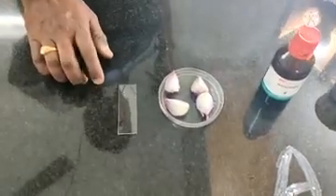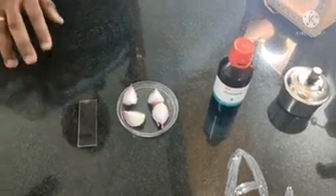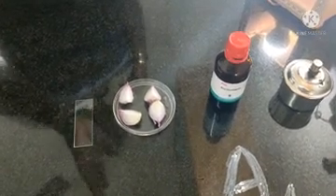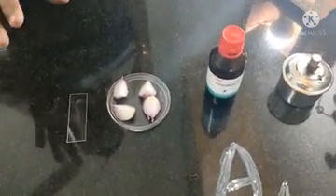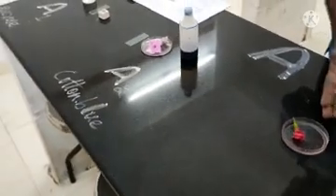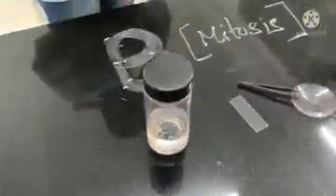The shape of the cell is found to be rectangular. Then the number of nuclei in a cell: as it is a plant cell, only one nucleus is found and it is at the periphery. Why? Because of the presence of a large vacuole. So these are the aspects. 3 marks for slide preparation and 2 marks for writing 2 points. Here you have to write down the labelled diagram. Then here you have to put the tabular column and find out the percentage of pollen grain germination.